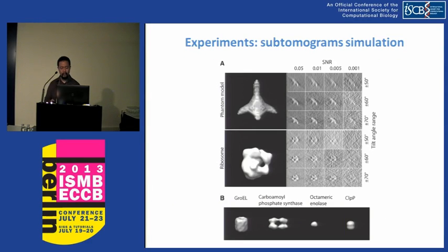So here we have performed the experiment on simulation data, on subtomograms simulated using one phantom structure and also 5 macromolecular complexes.